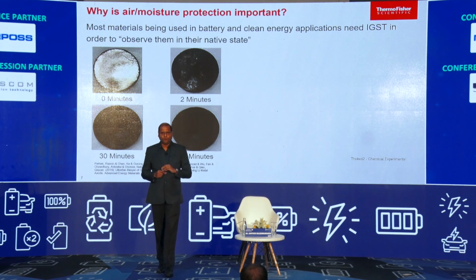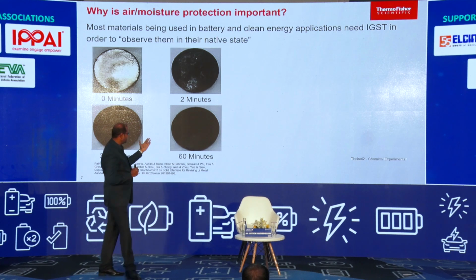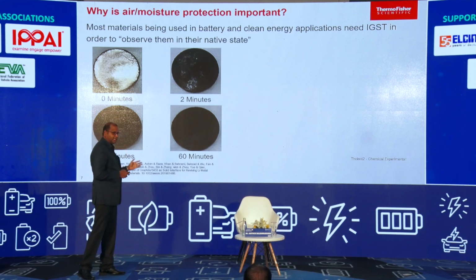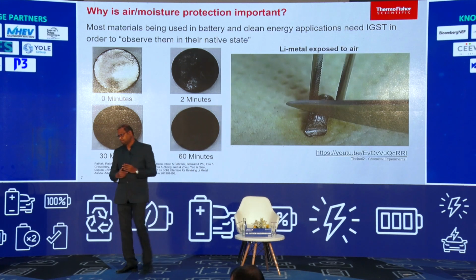Lithium in its pure form is a BCC structure, which means a body-centered cubic. Whereas as it gets oxidized, the performance of this material is greatly compromised. I will show you in a quick video.